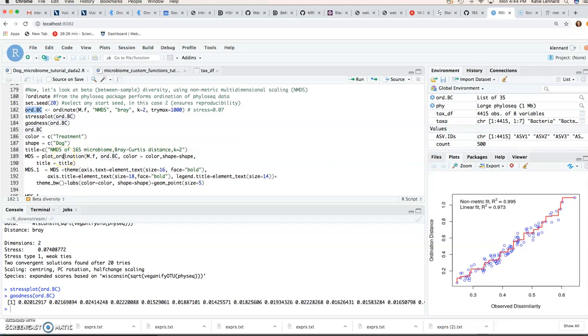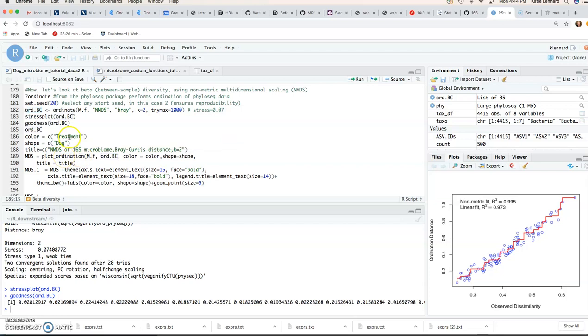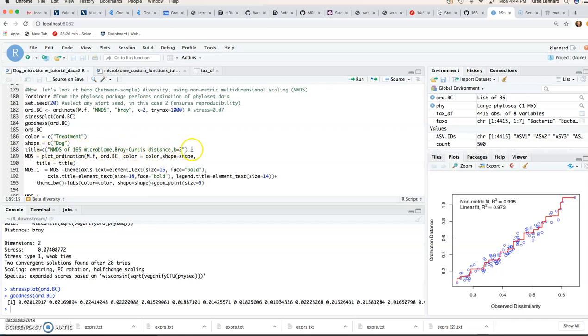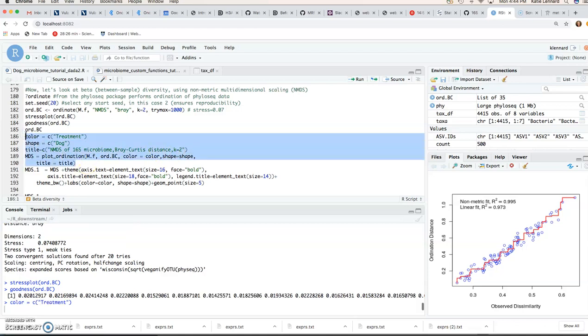And then we're just going to add some color and shape parameters. So we can select just as we did before. We can color by treatment and have shape as our different dogs. We can add a specific title with our parameters that we used. So let's run this.